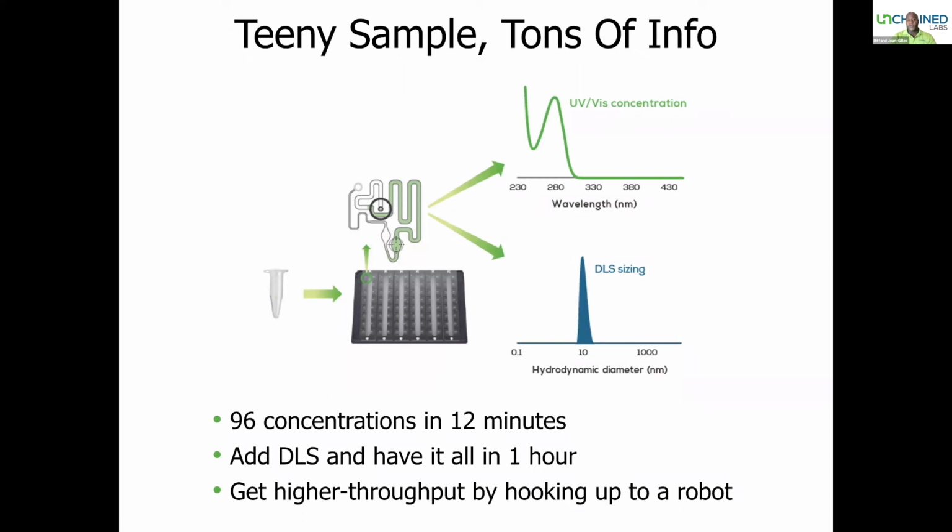So what's unique about it is the actual sample holder, or the plate, right? So we have those cuvettes that allow you to read directly there, and they're very, very small, and we can then use that to measure both the concentration and the DLS of the samples at the same time.